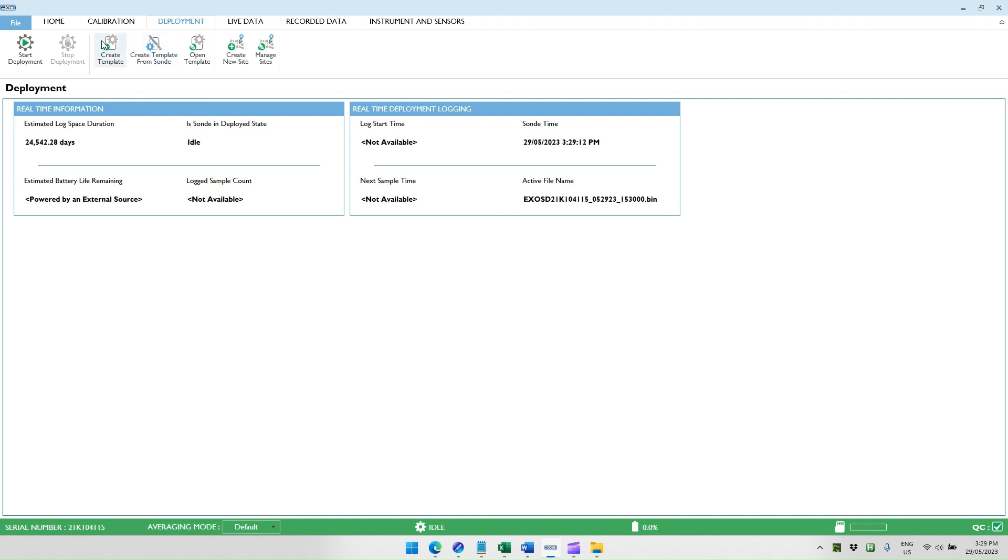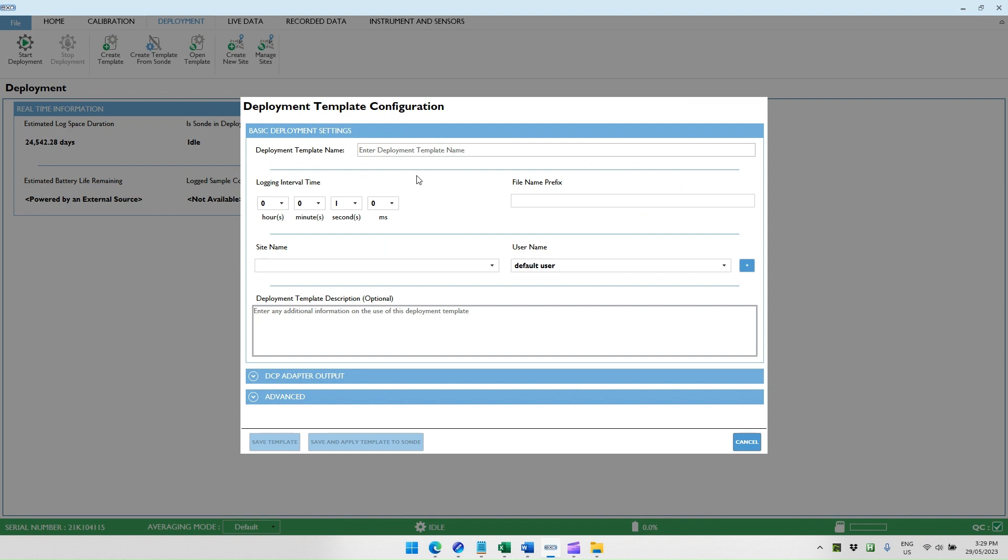You can either create a template from scratch, or you can read a template from what is already being used on the sonde and use that as a basis for your template. In this example, I will create a template from scratch. The first step is to enter our deployment name. For the sake of this, I'll just call it demonstration.